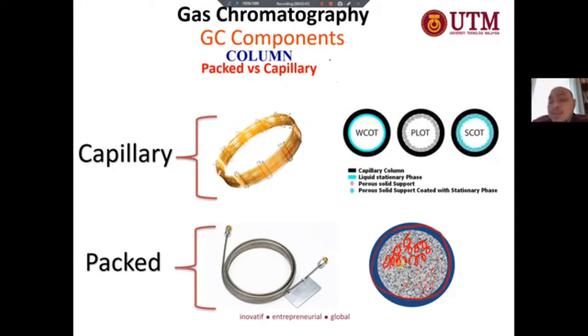It's very hard for you. Just make it a circle a lot larger also. Okay, so it will take less time. Then if we compare it with the capillary column, we just say here is the wall and the inner is empty. So open tubular, or we can call it the open tubular. Open tubular means that the middle is empty.